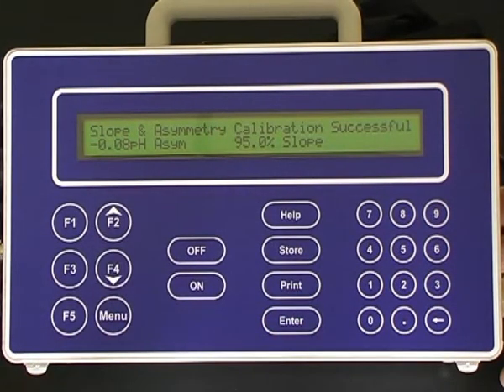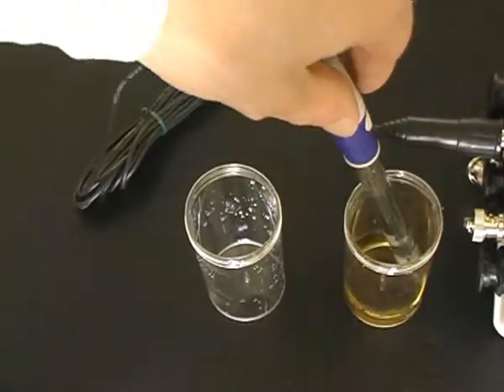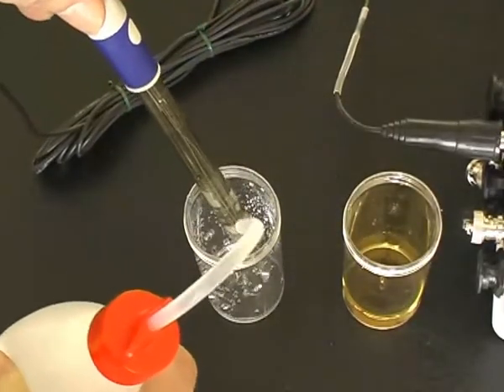The instrument then displays the sensor performance, a slope and asymmetry. Remove the pH sensor from the 6.88 buffer and rinse with deionized water before use.